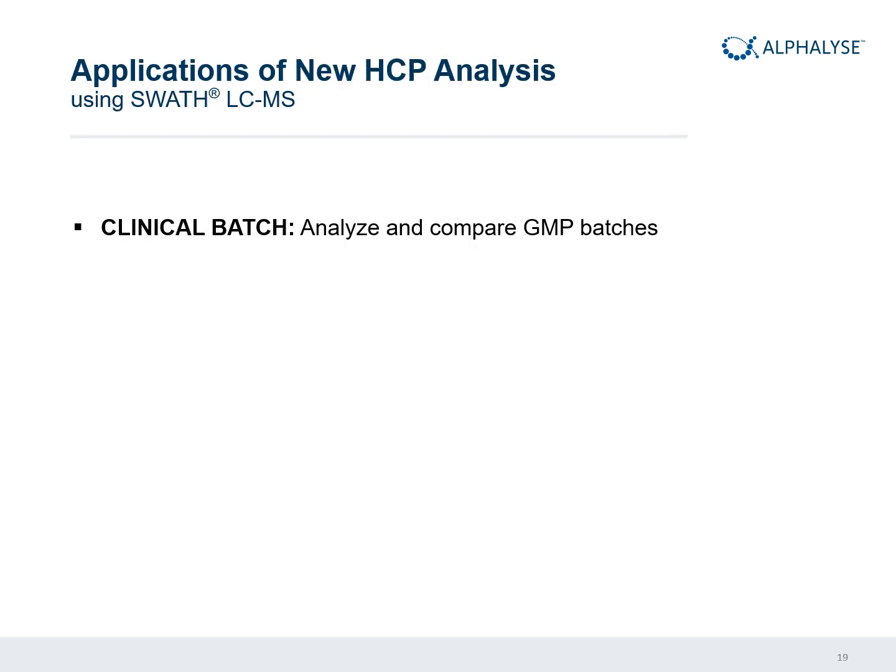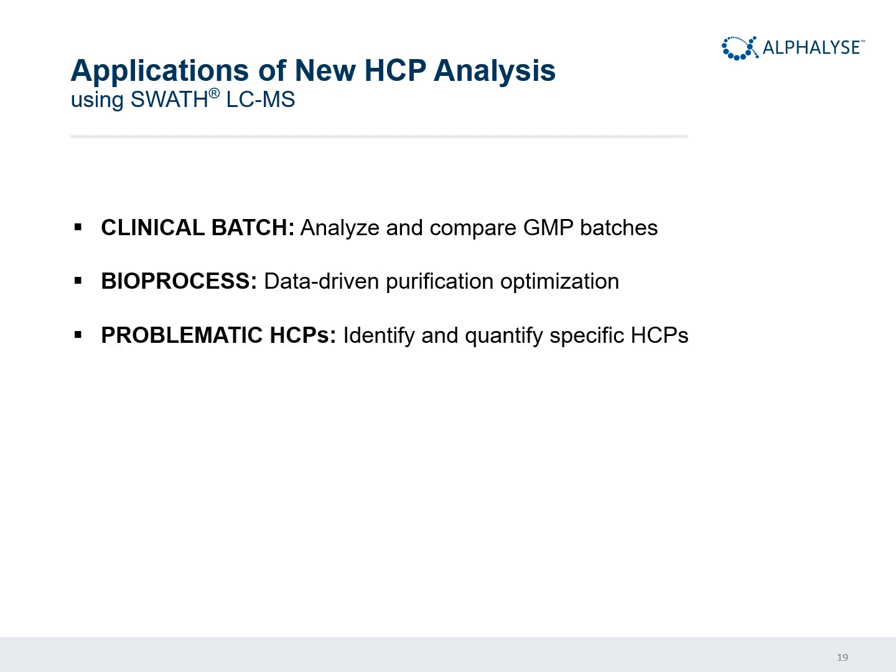So this method, originally we were looking at using this as a replacement for ELISA, and I pretty much have to say that this is not going to happen, but I think it will be a method that will be used in combination with ELISA for many years. So it's very good to analyze and compare batches. Perhaps most of our clients are actually right now using this for bioprocess optimization, so it's a data-driven purification process.